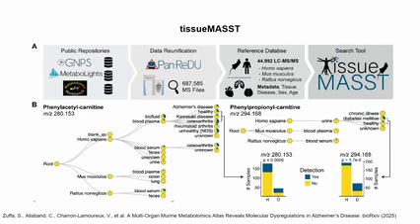We also have now, besides MicrobeMASST, this new tool called tissue MASST. Here it will give you biofluid distribution. Again, it's a little bit like reverse metabolomics, but visualized in a different way. In this paper, we confirmed 2 new molecules, which are 2 different carnitine derivatives. We wanted to map their distribution rapidly and see if they're associated with a specific disease.